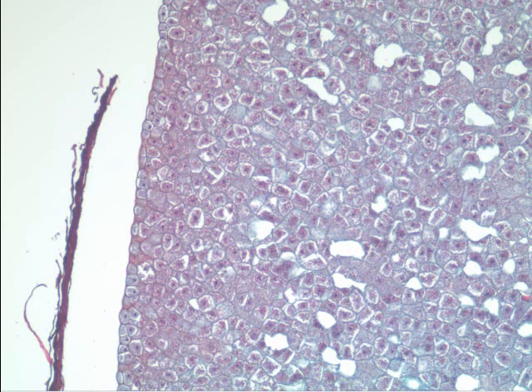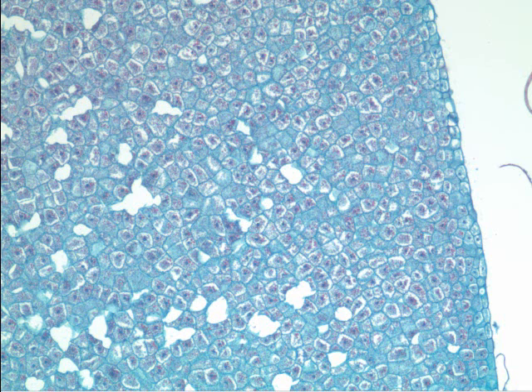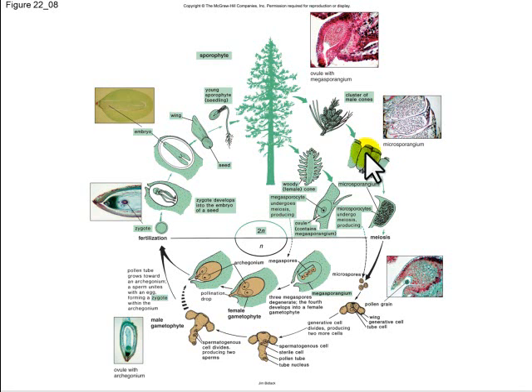And so, as you look at this specimen, I can't get any smaller than this. One thing you'll see that's missing from the specimen is the seed coat, the old sporophyte generation, the original ovule tissue. But what do we have here? Embryo, over here, female gametophyte. And there we have total female gametophyte. And so we showed the development of a pine seed. That's your pine life cycle, ladies and gentlemen. What some things really look like.